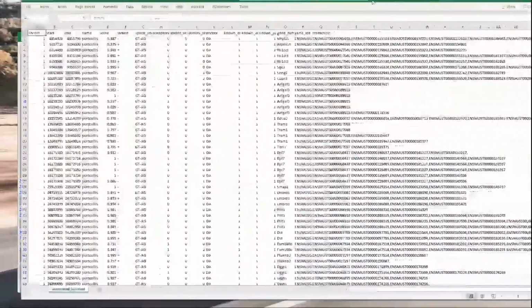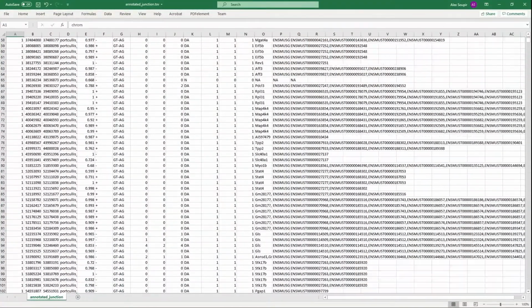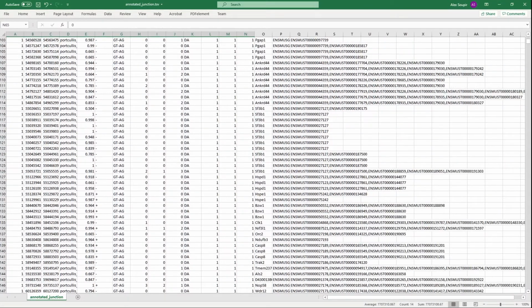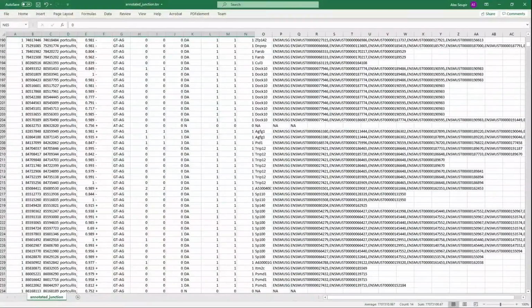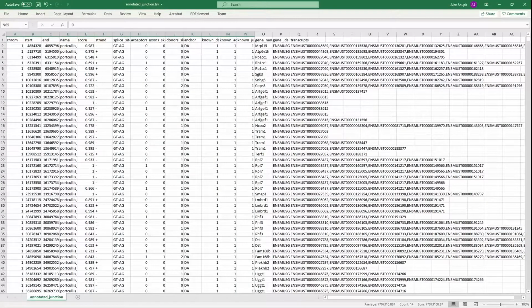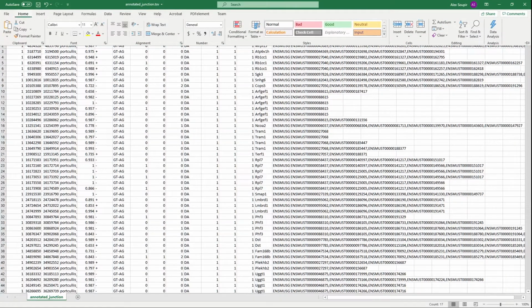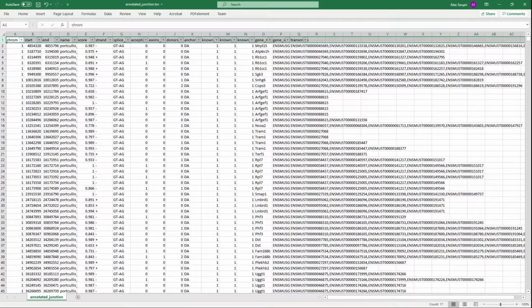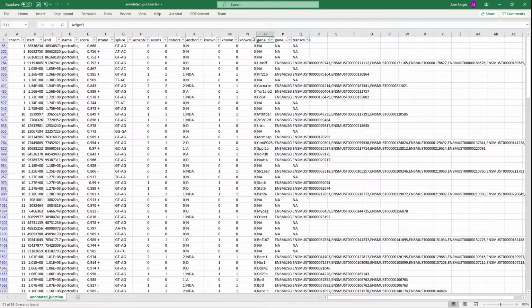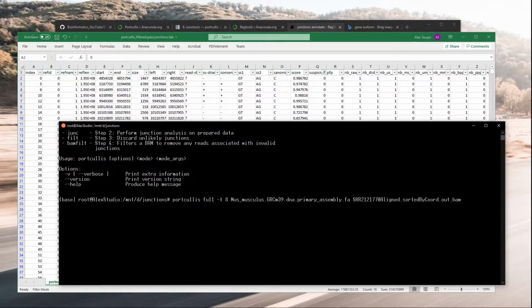For example, if we pull this up, it looks like almost all of ours are known, except very few. But it's a subset file too. So if we go back up, we can filter this and look at known junctions, probably not going to be many. There we go. Okay. So I'll show the code that I did for that one too.